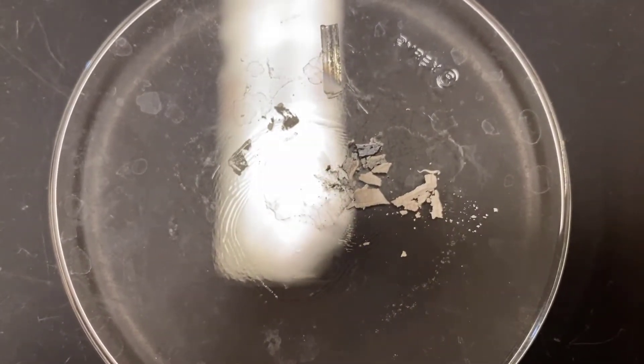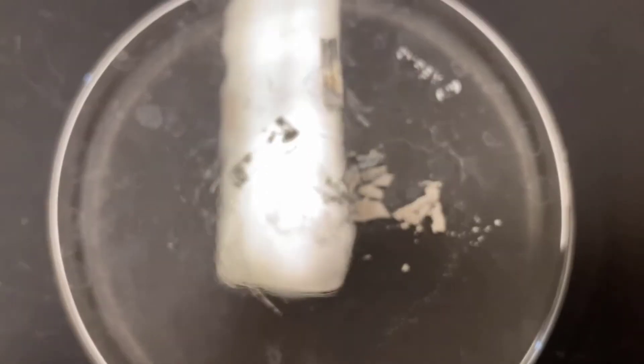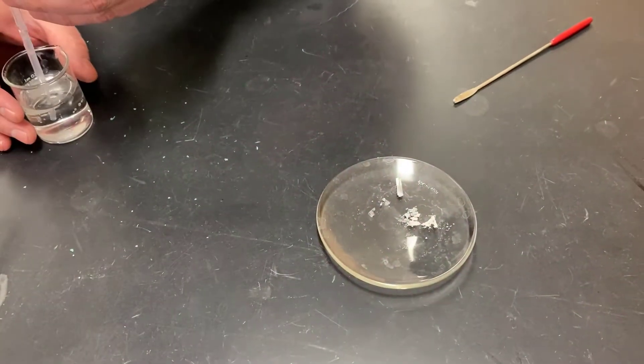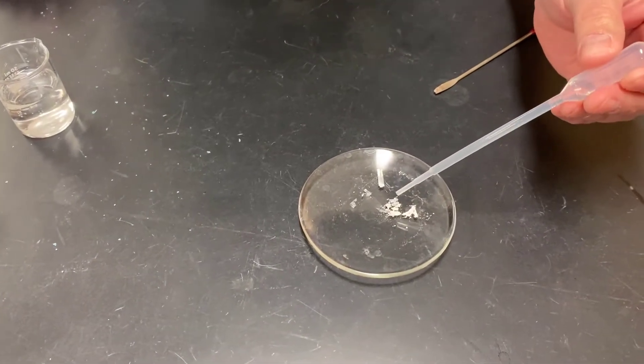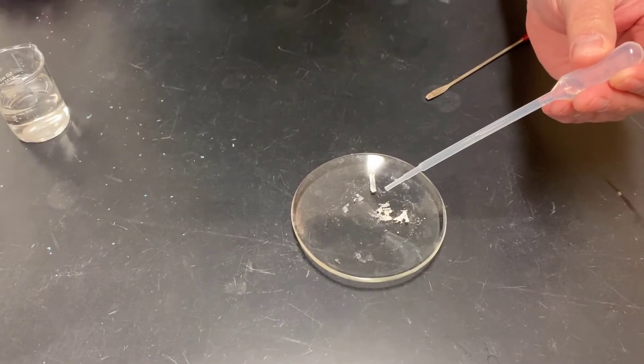Next, we're going to go ahead and add some water to this to do a new reaction. I'll carefully place a couple drops of water — just plain water — to the substance we made earlier.